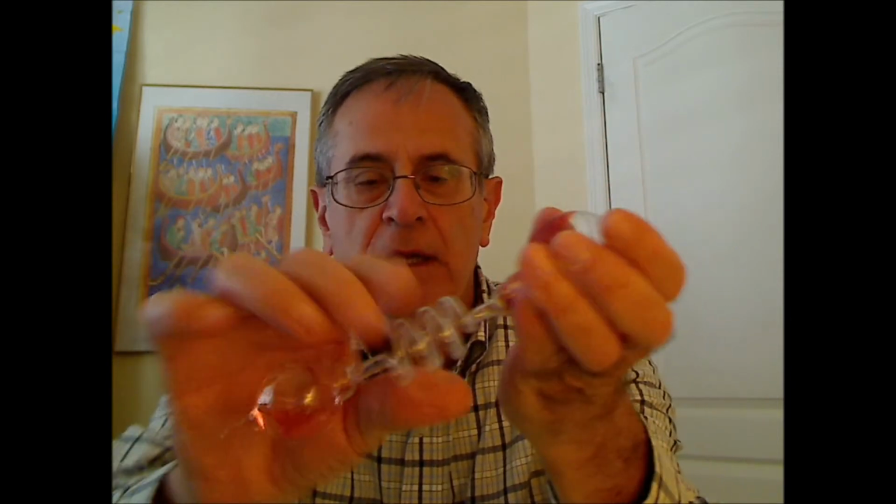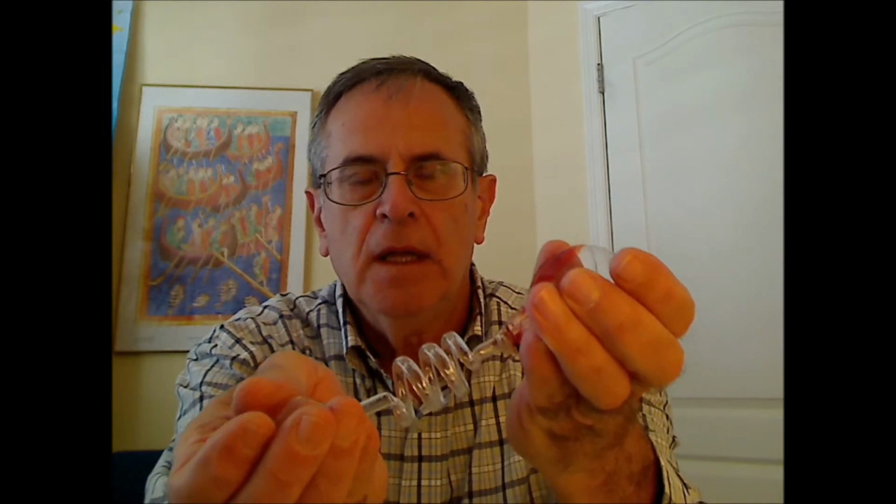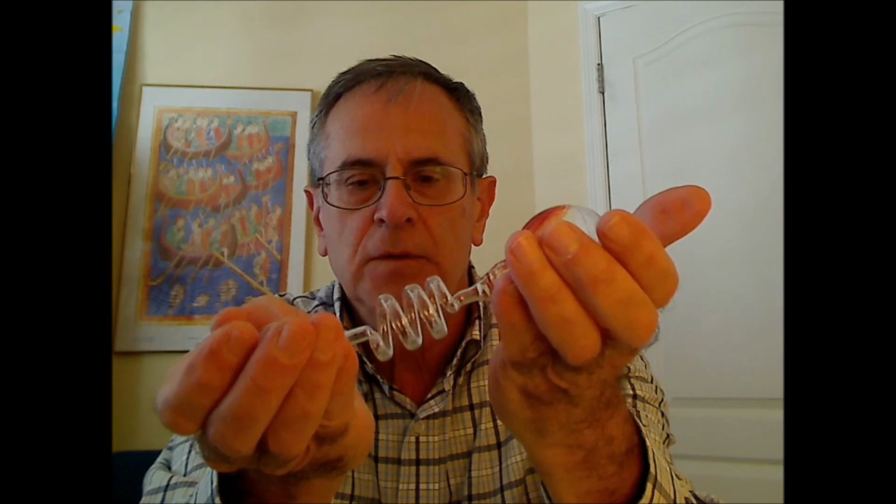And one has to be careful when you're heating. Just apply gentle heat on this side and put it in something cool on this side. And it might be good to have some protective shielding just in case you are heating something in a closed container. So be very careful.